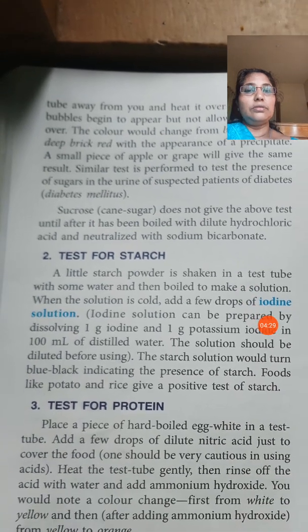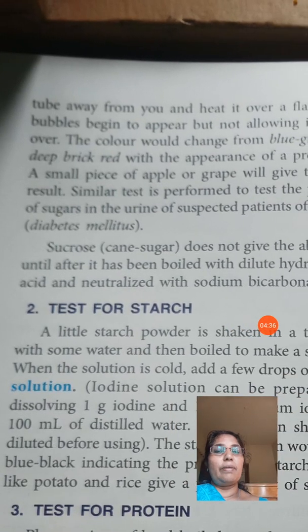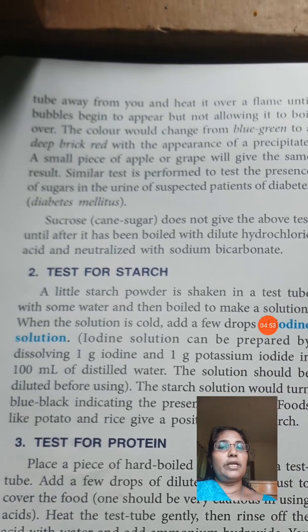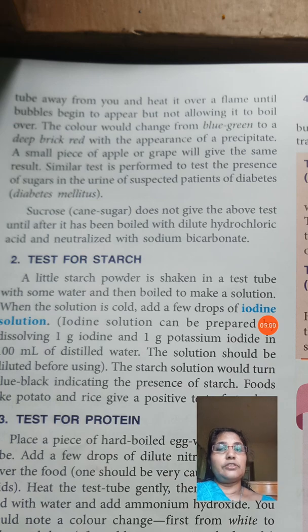After that we can heat it over a flame until bubbles begin to appear, but not allowing it to boil. Then after heating for some time, its color changes from blue green to a deep brick red color with the appearance of a precipitate. A small piece of apple or grape will give the same result. Apple and grape also contain glucose in them. So if we heat it in the blue green Fehling's solution, after heating the solution will turn into brick red color.